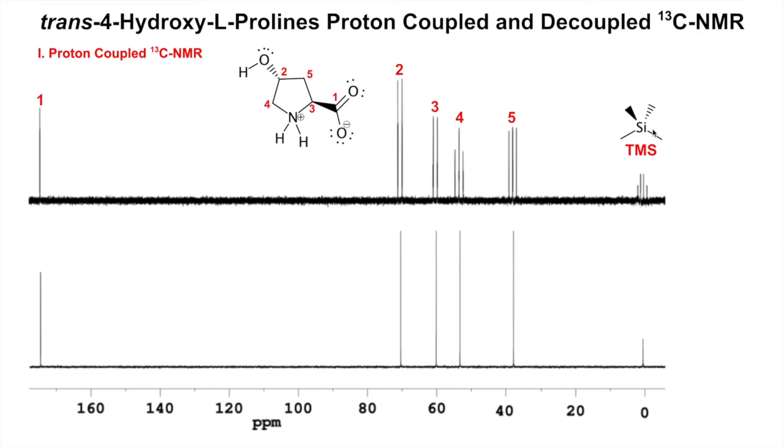There it is. And then the TMS, it has 4 equivalent carbons in the tetrahedron around the silicon. And those 4 carbons have 3 hydrogens each. So those 3 hydrogens, 3 plus 1 would be 4, N plus 1 rule, right, would make you a quartet. Okay, so this can get really messy, so it's not normally done, but there are experiments that we do to figure out things like, oh yeah, this tells us it's a doublet, that there's 1 hydrogen on that carbon, but we won't usually do it this way. We'll usually do something called 2-dimensional NMR, which we'll talk about next semester.